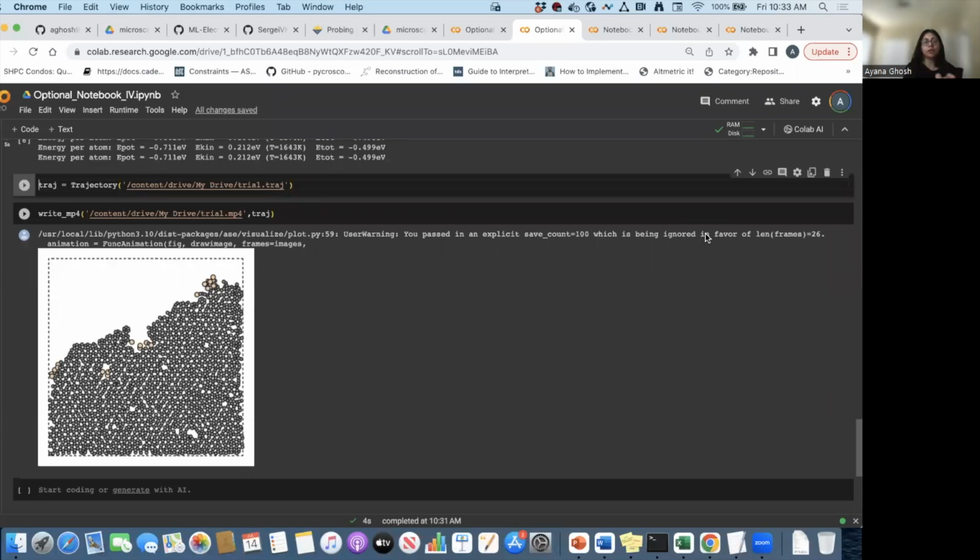And the next part of this workflow, this is a separate workflow where you're learning how to essentially use the network output to perform simulations. If your task is to just identify features, notebooks 1 and 2 are good. That's where you end it. But we are material scientists, so we want to learn how and why things are happening, and that only comes from theoretical understanding. That's where we go to the simulations and try to implement this end-to-end workflow on the fly.